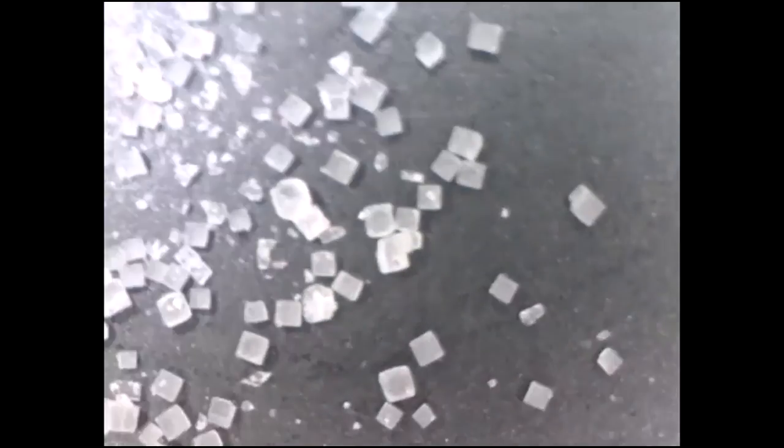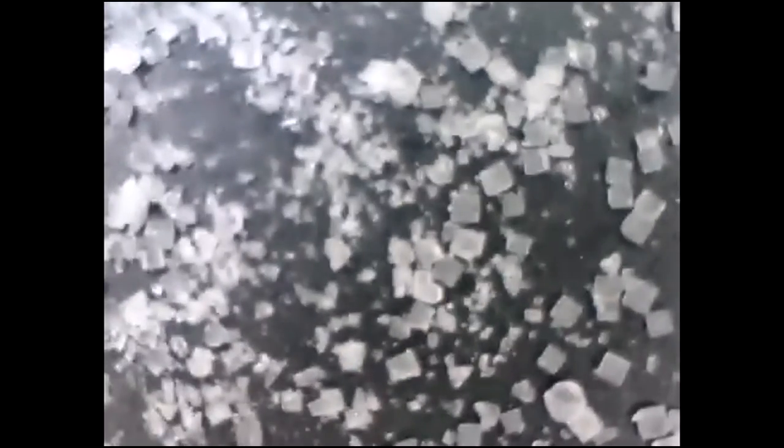If I try to crush it. Is this solid A? This is A, yes. Everything I do, I will tell you if I do A first for each one of them to make it consistent. If I try to crush it and then look at it, I was trying to do this earlier, you can sort of see, it does crush. I've ruined my beautiful little cubes by crushing it. You can kind of see that. And that is A.